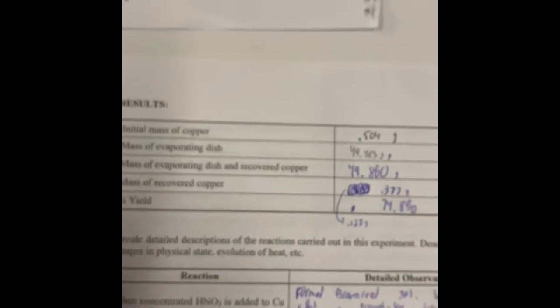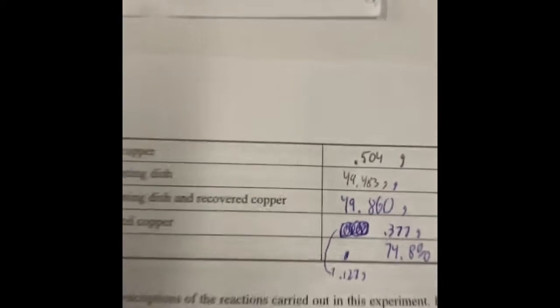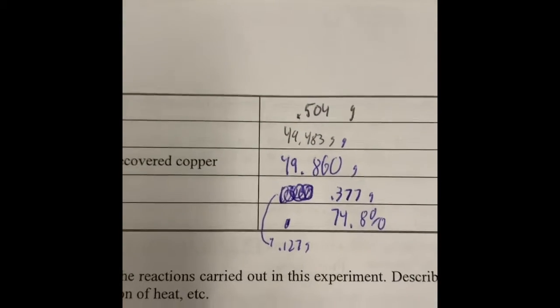Now that all of that is done, we can go to the mathematical side. Using this chart, I initially started with 0.504 grams of copper. The initial mass of my evaporating dish was 49.483 grams.